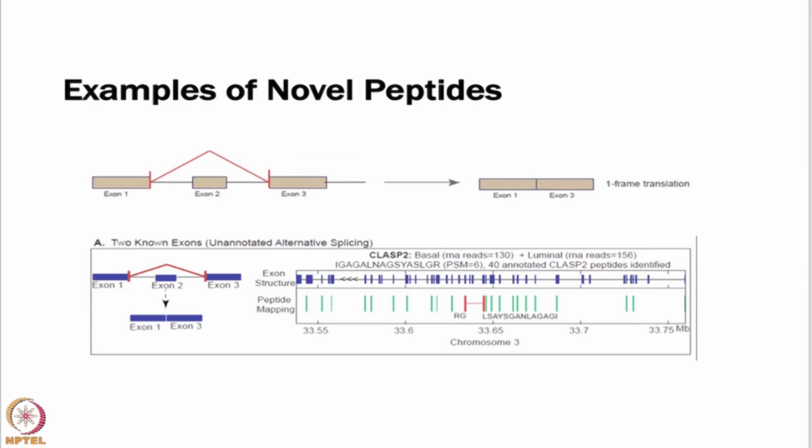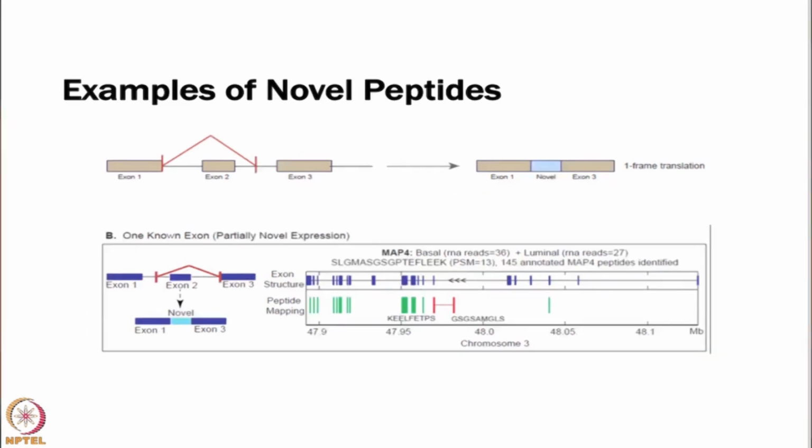There's evidence for this at the peptide level, where you're connecting this exon with another known exon that did not have annotation in the database for that connection. Or a connection between an exon and some intergenic region. Here's an example where an annotated exon is connected to this intronic region, and there's evidence at the peptide level for this connection because we added it into the database.